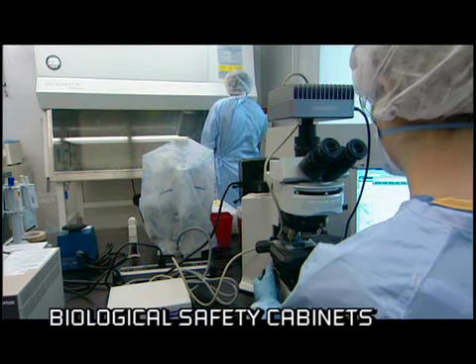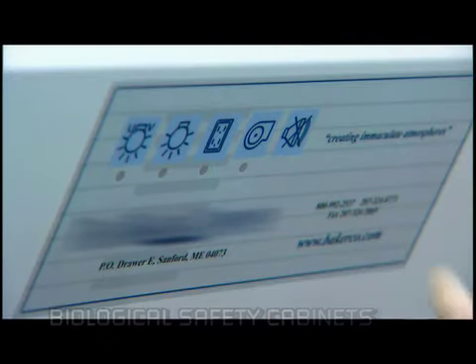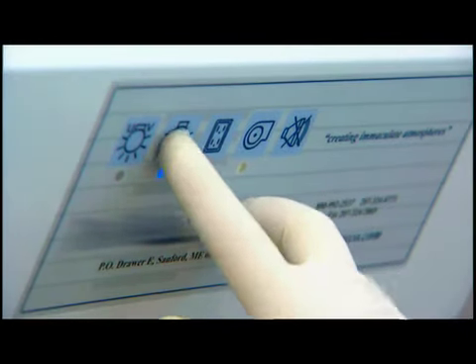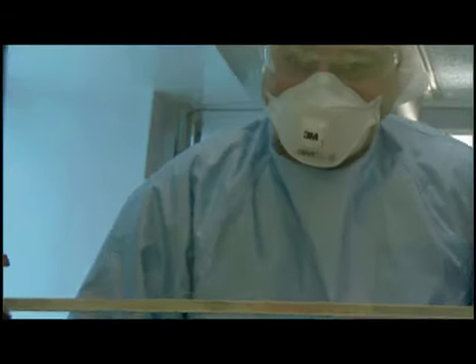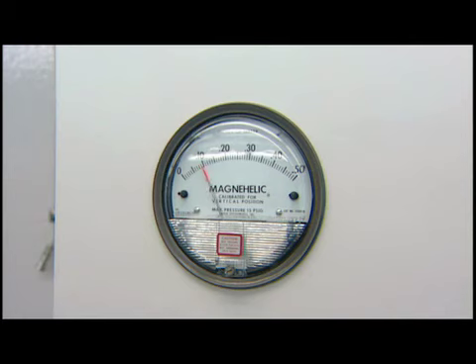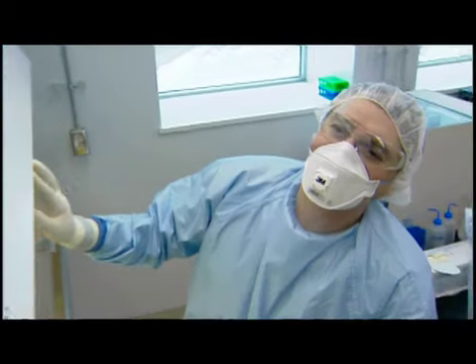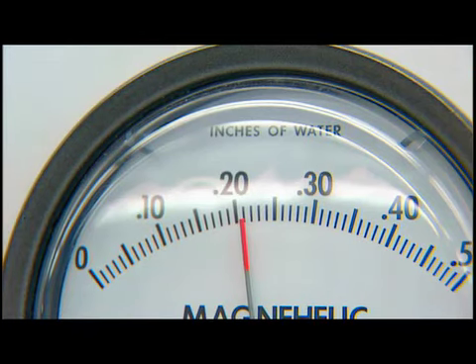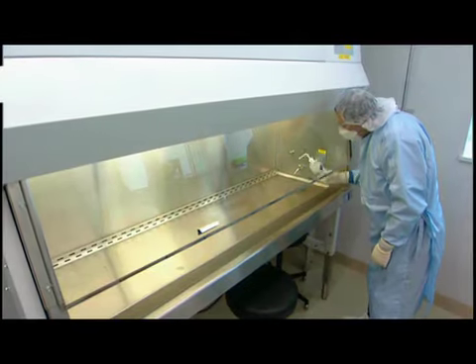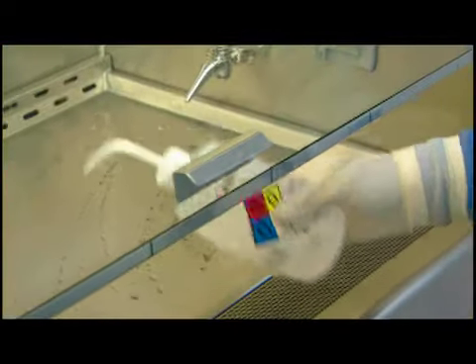Turn off the ultraviolet lights. Turn on the cabinet blower and fluorescent lights. Check air intake and exhaust grills for obstructions. Confirm inward airflow by verifying gauges or by some other means. Disinfect the interior surfaces.